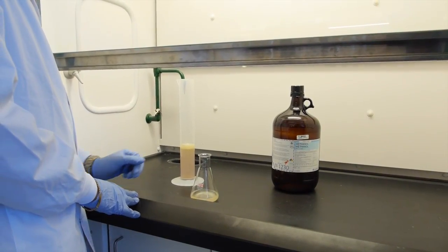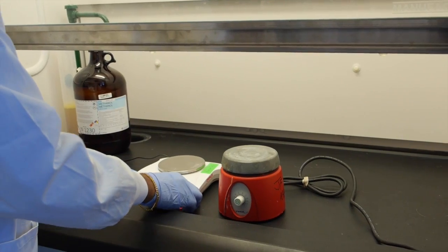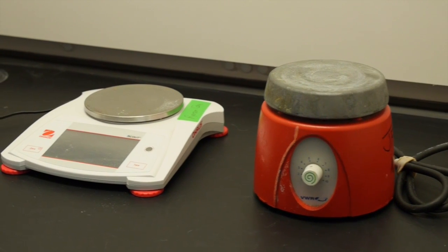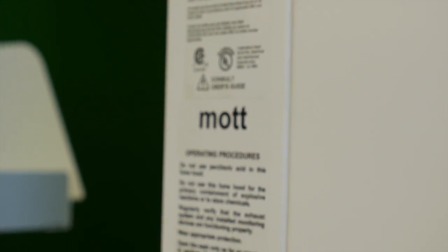Any experiments that are conducted and have sources of emission should be located at a minimum of 6 inches inside the hood. Equipment should be located 9 to 12 inches inside the hood. Remember, these are only guidelines. For more details, always refer to the manufacturer's manual and instructions for the specific fume hood that you've purchased.